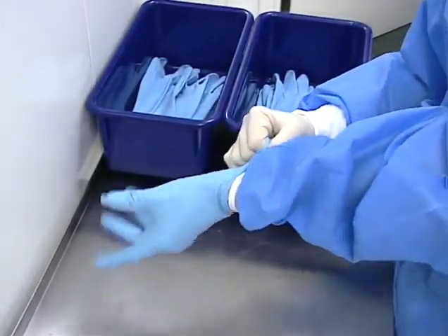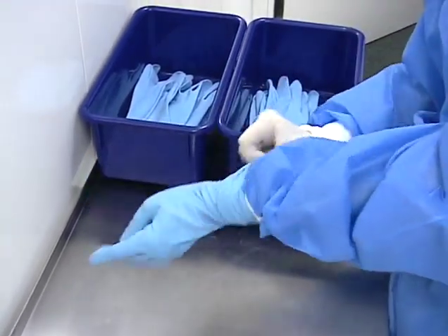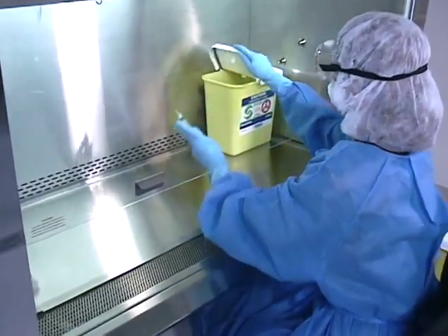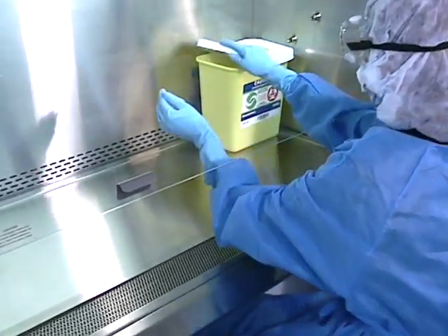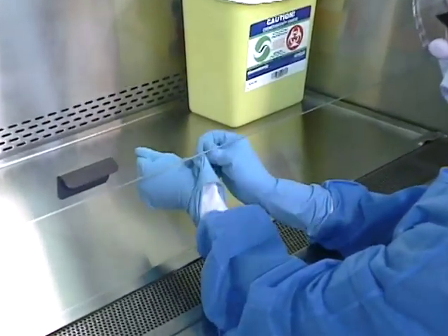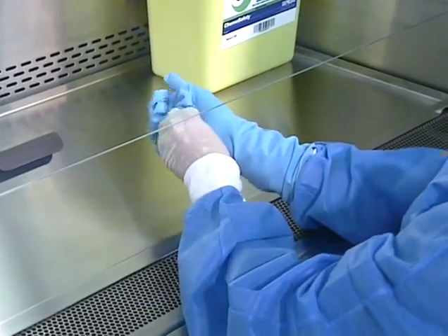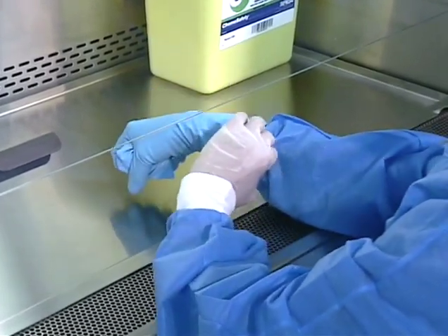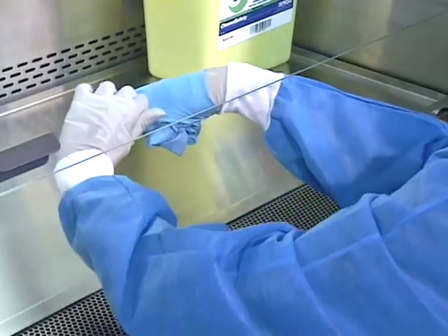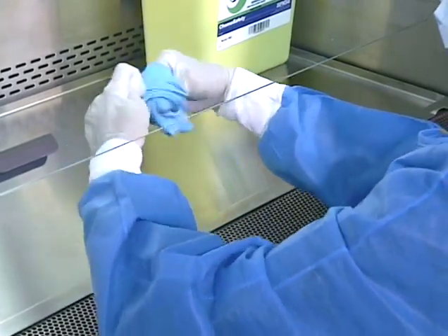The outer pair of gloves should be removed whenever the hands are removed from the BSC to avoid transferring hazardous materials to the environment. Deglove the outer pair by grasping the outside of the first glove, near the cuff, and pulling the glove off inside out, reducing it to a ball in the opposite hand. Remove the second outer glove by slipping the fingers of the other inner gloved hand under the cuff and pulling the remaining outer glove down and over the first glove, taking care not to contaminate either inner glove.